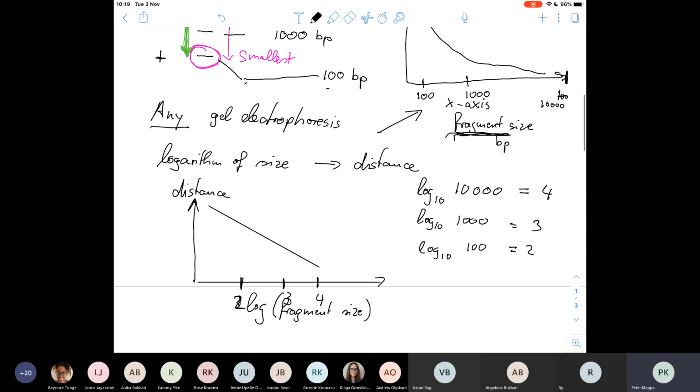And if we've got a standard curve, and you know now, because of the last session in BI 308, we know how we can do such a standard curve. By the way, is that a positive or negative correlation that we see here?